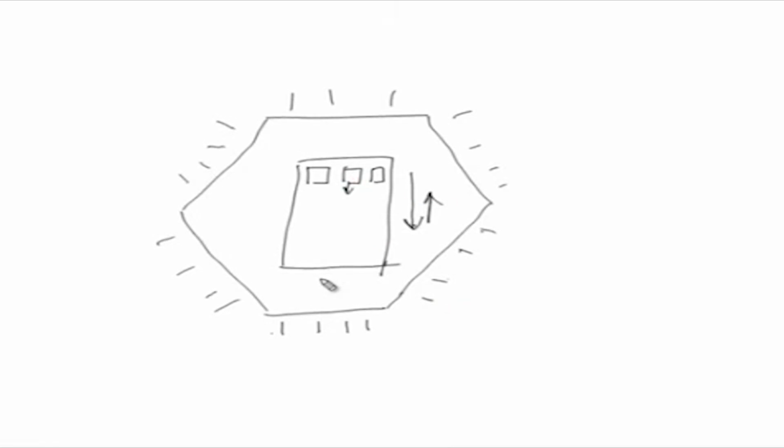So the time and the amount of electric field in the forward direction will always be higher than in the reverse direction, so that the resultant movement is forward.